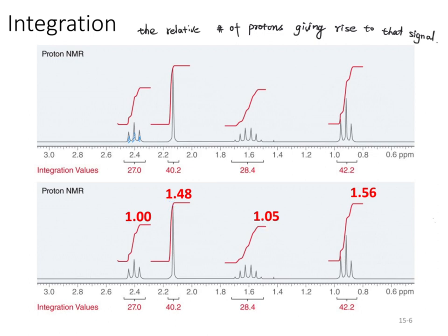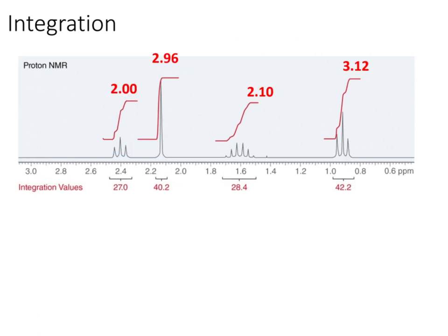And if you are looking at the molecule, probably this molecule can have this type of proton, 2 of them, 3 of them, 2 of this, and 3 of this. So that integration number right here is just a relative number of protons, the ratio between them. So the message here is integration is a relative quantity rather than an absolute count of the number of protons for each signal. It's just a relative ratio of each type of proton with a unique electronic environment.